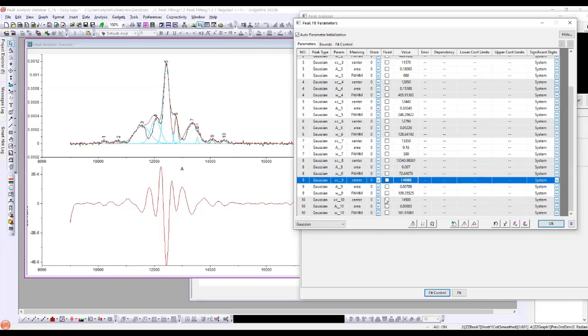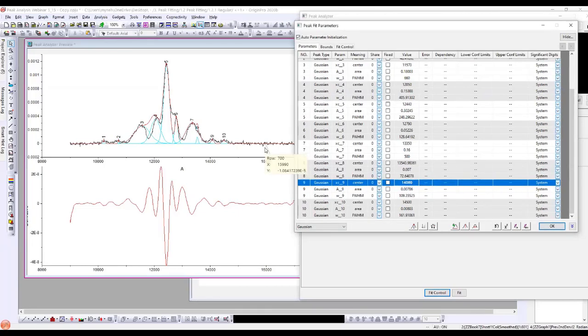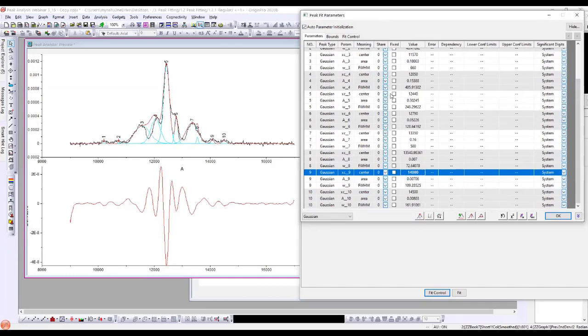The reason I reset these initial parameters is that the initial guess of the fitting parameters is sometimes very critical to get a proper fitting, because the algorithm will search the parameters in a very large parameter space. If the initial guess is far from the optimal value, the fitting itself will go crazy. So at this time, I will show you some other things.